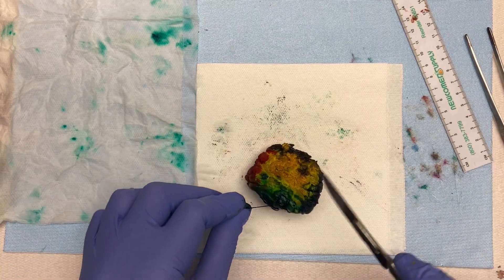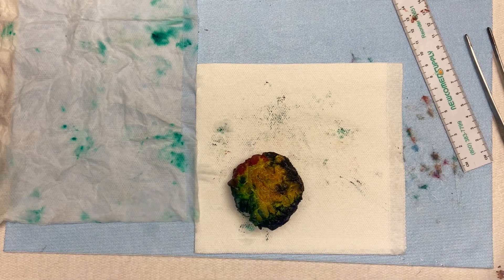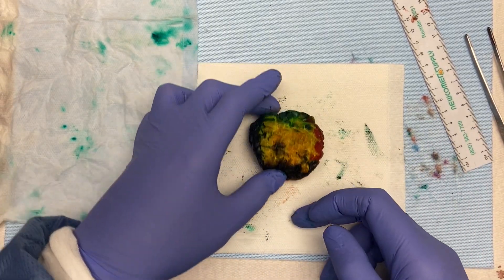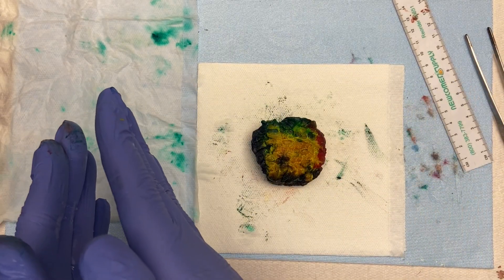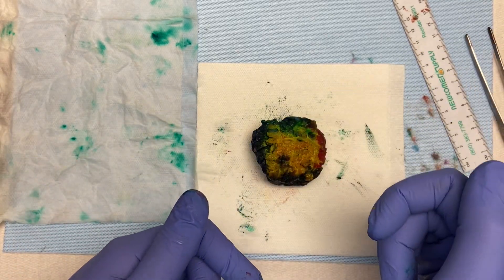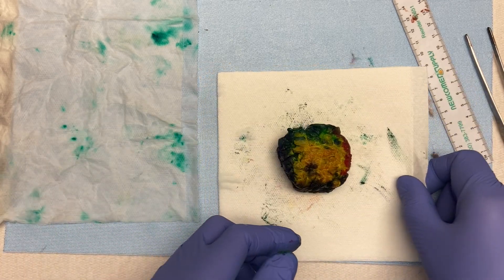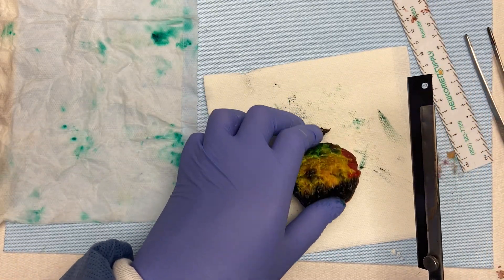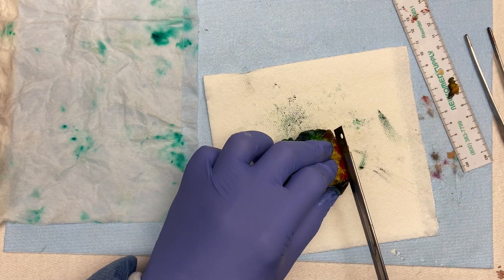This is a right breast — anterior, posterior, superior, inferior, lateral, medial. I always section right to left, so because this is a right breast I'll go lateral to medial. If it were a left breast I would go medial to lateral. It's very systematic. Then I just take my big knife and start slicing.